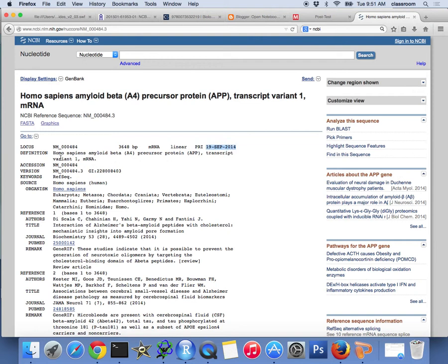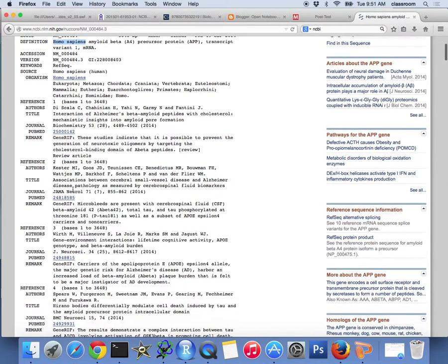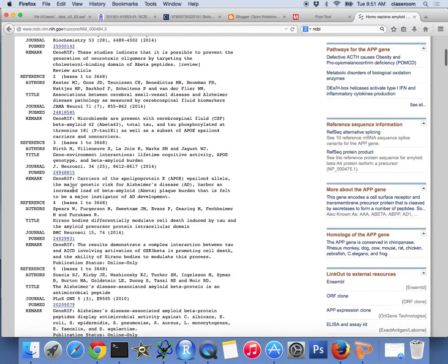This is the human organism Homo sapiens. That's human. I think the question also asks you to find out how many exons this gene is.